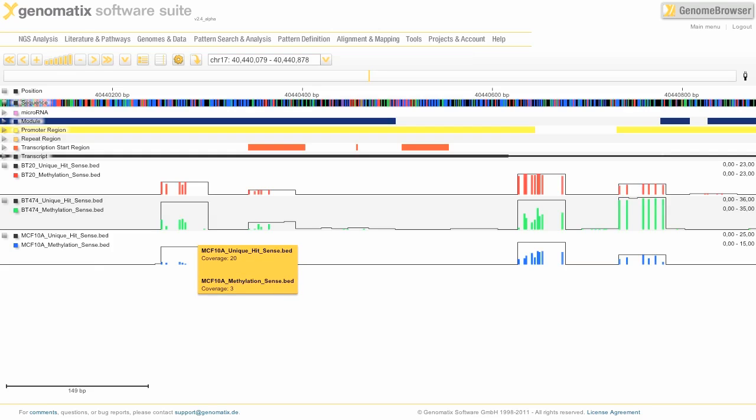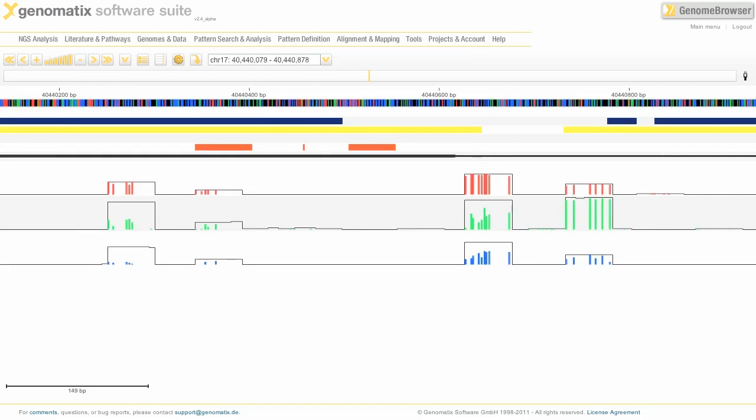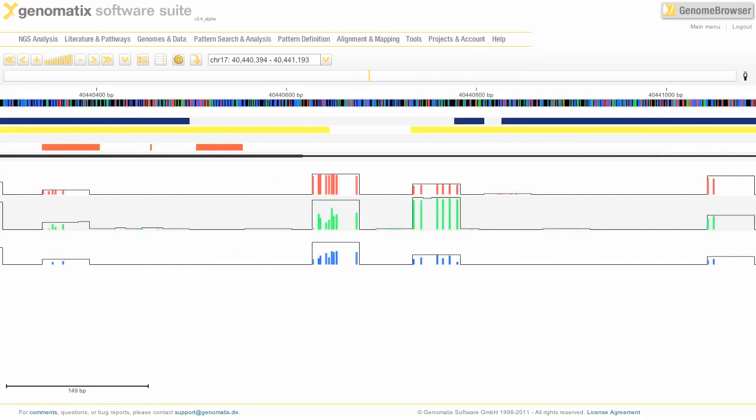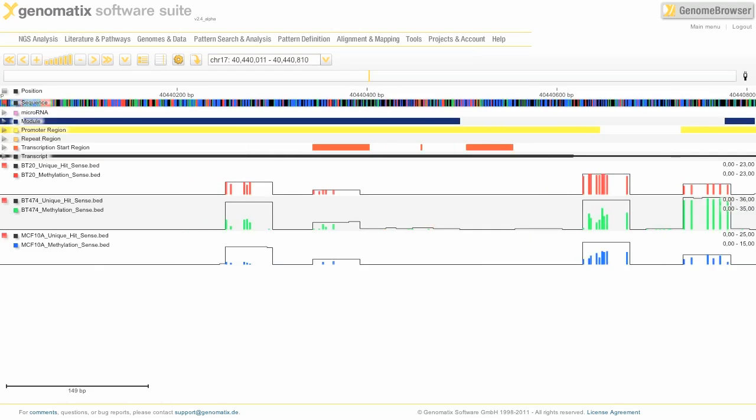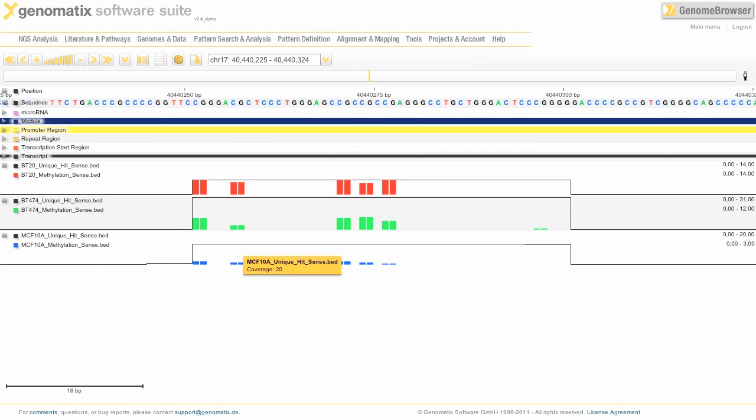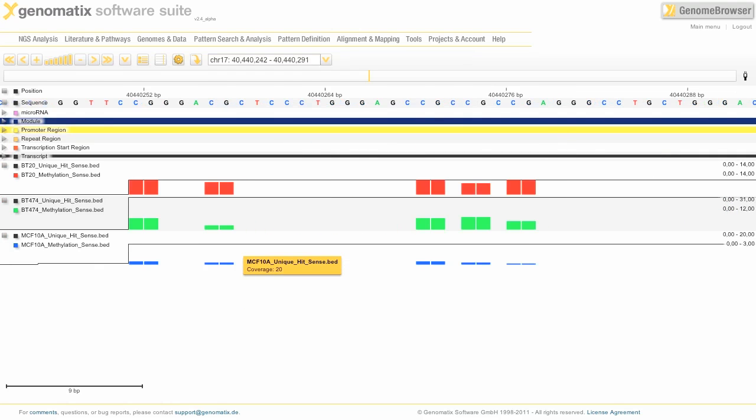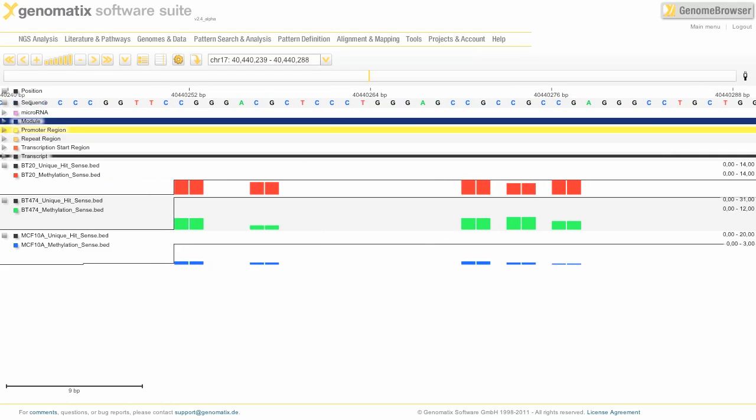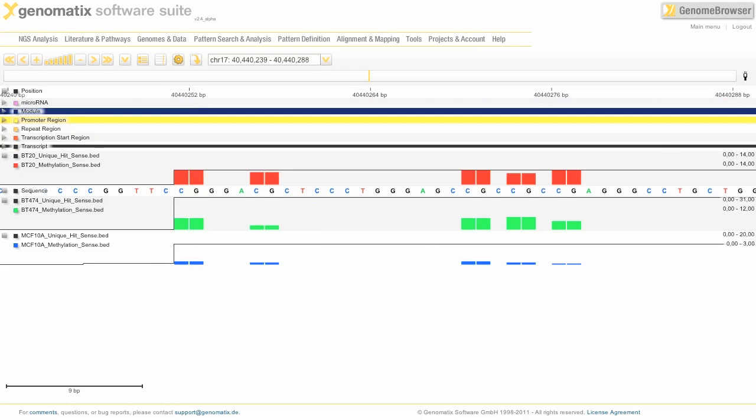And the tooltip can give you the exact numbers. Here we have a coverage of 20 in total and three of those reads that cover this region were methylated. You can drag around the genome to look at different regions, or you can zoom in into a particular CpG island to look at the methylation in more detail.